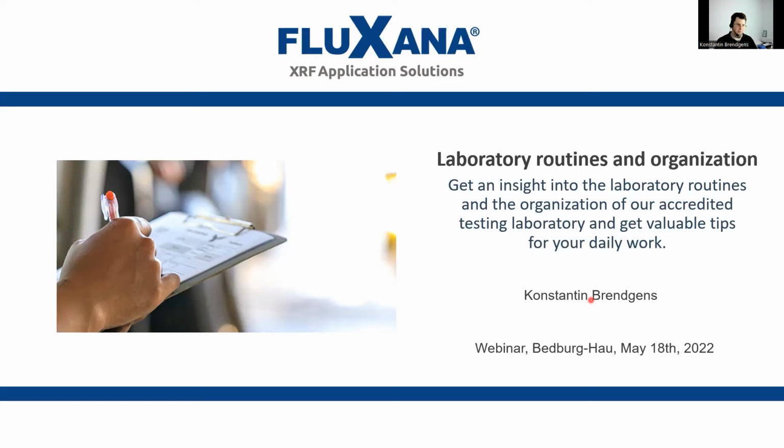Okay, today's topic, again, we'll talk about laboratory routines and organization. Basically, we want to give you some examples of how to answer a specific question.